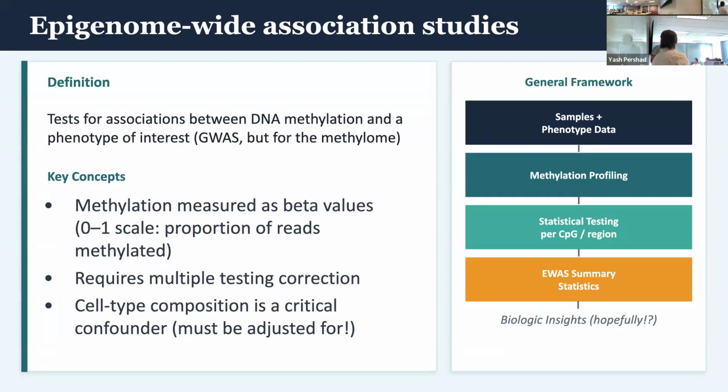How do you correct for it? I guess you just encode the batch as a dummy variable or something. Yeah, that is why we tried to put everything on a single batch. You have to be very careful with randomization and experimental design, because otherwise you can end up being unable to do comparisons. So it just takes a little extra thought. If you're like, I want to get this off to the sequencer, we're getting another shipment in a month, if it was me, I'd probably just wait. But yeah, that's a good word of warning.